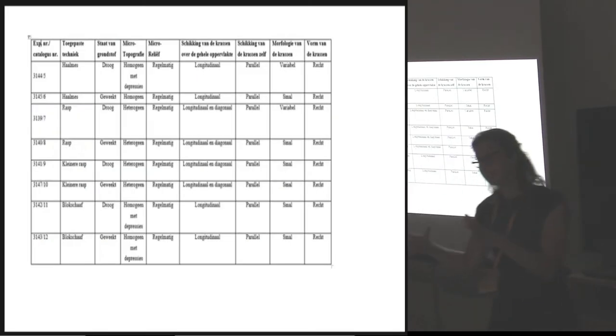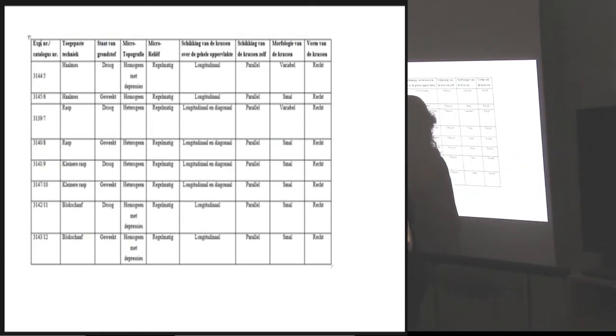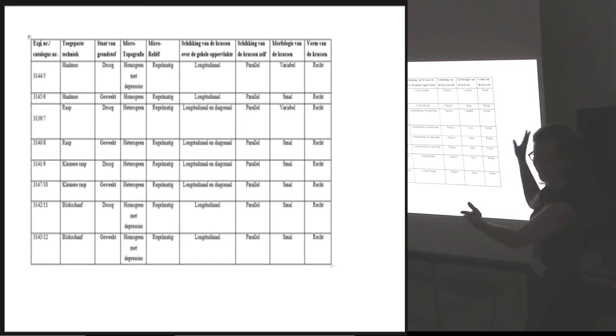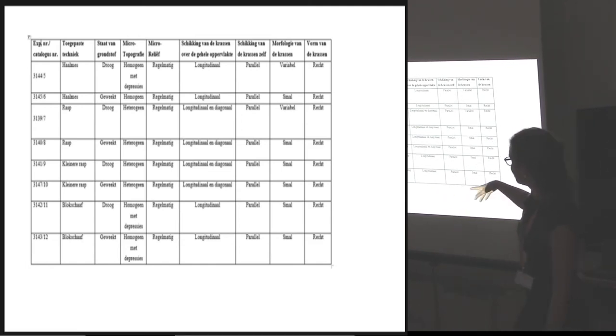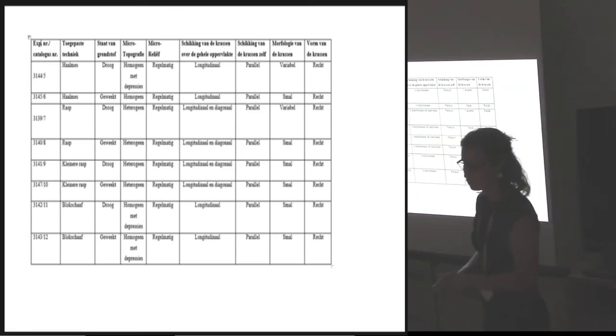All these elements are recorded for every object. So these are actually the experiment numbers. And every time I put the, this is in Flemish, so don't try to understand. But you have the instrument and then all the parameters that correspond to that instrument.